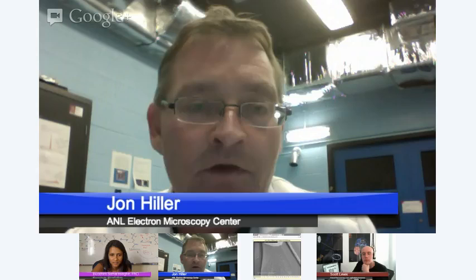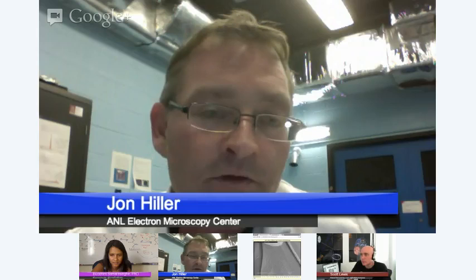Yes. Right, okay. Mm-hmm. And so what I was doing there was making a point for something called atom probe analysis. And it's a totally different type of characterization. It's not electron microscopy. But the sample preparation for this instrument is very, very complicated. Right. So you have to make a needle-like structure with a tip diameter of less than 50 nanometers. So how do you do that?